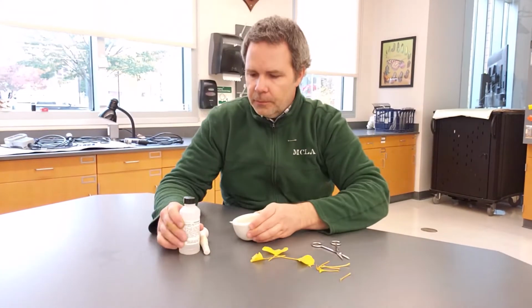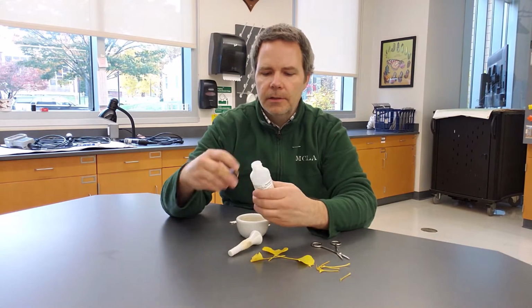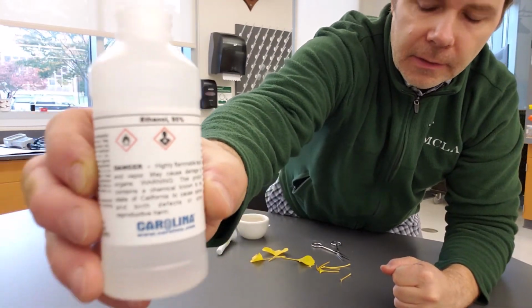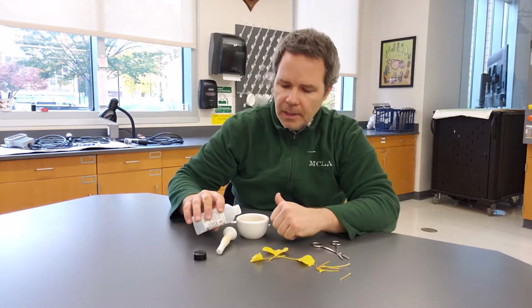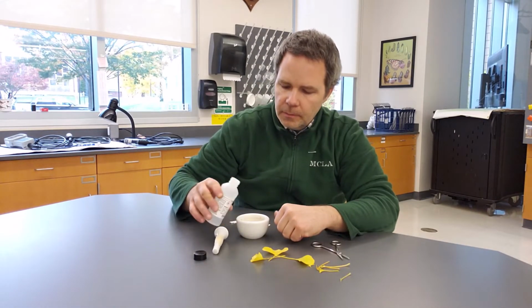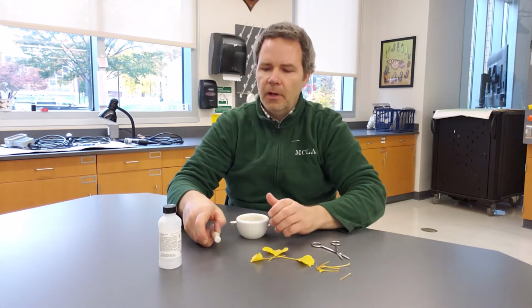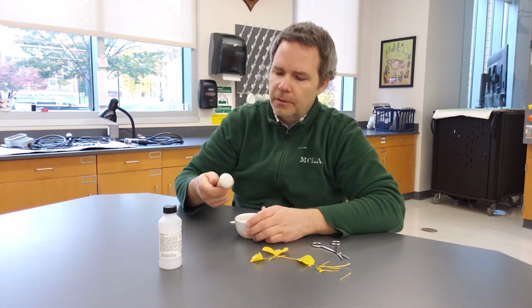Okay, so then I'm going to put in some of this ethanol. This is 95% ethanol. This is going to help bring the pigments into solution as I grind them up here. So I'm going to put a little bit of ethanol in there. Ethanol is very volatile, so I'll try to keep the lid on there so it doesn't evaporate.